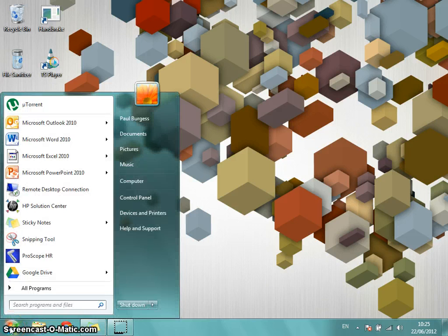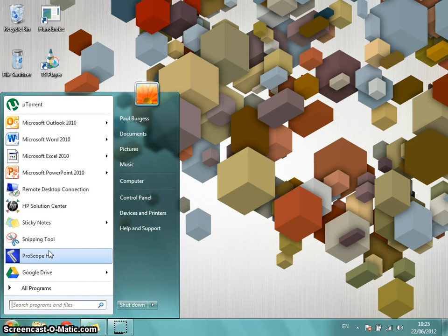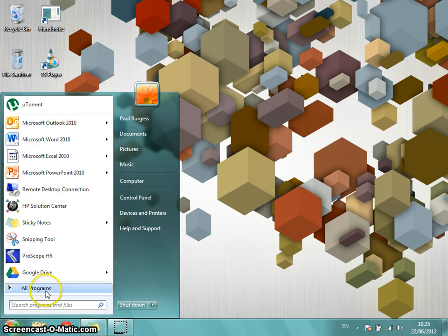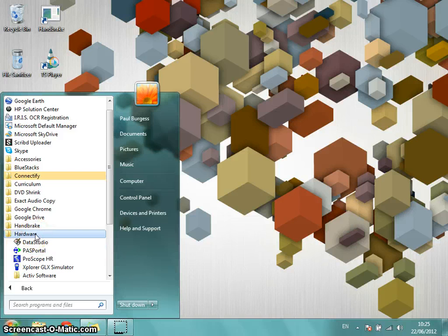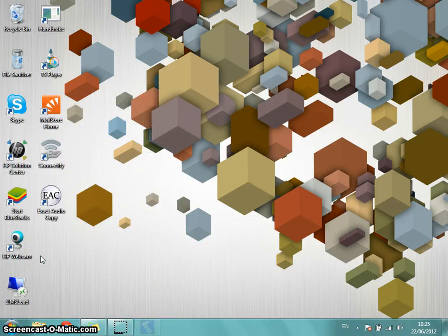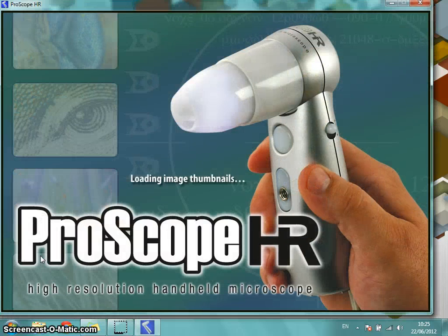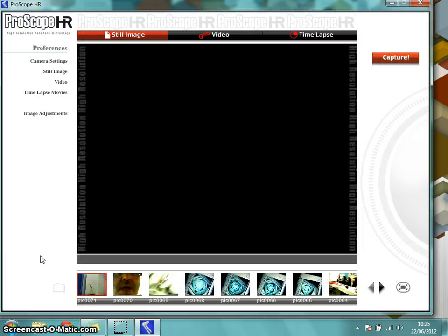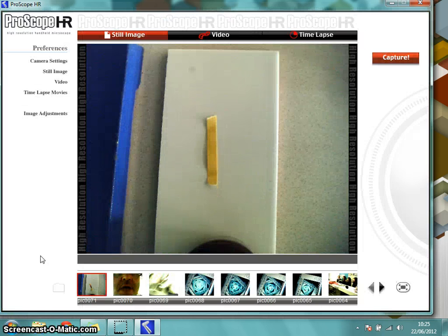I go to the Start menu and ProScope HR — that's the program. It's there because I've used it frequently, but if you want to find it for the first time it's All Programs, Hardware, and there it is: ProScope HR. Just a moment for the program to load up.